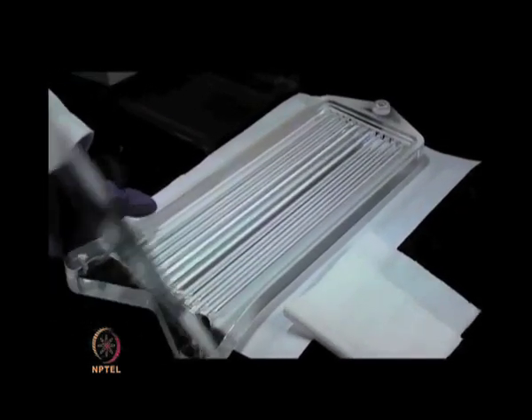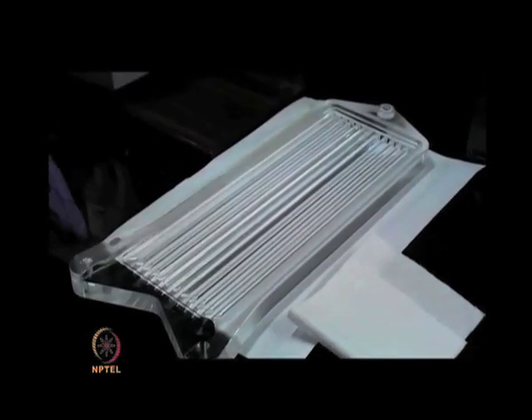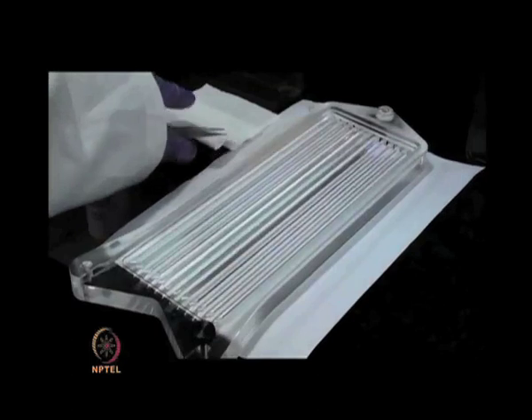Carefully remove the IPG strip from the rehydration tray and drain out any excess oil by blotting it on a tissue paper.